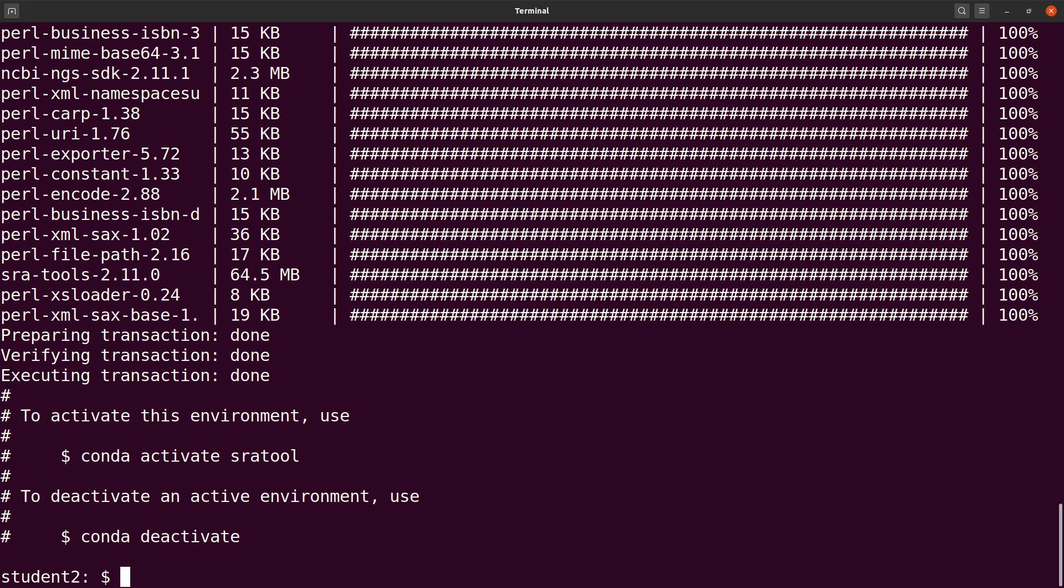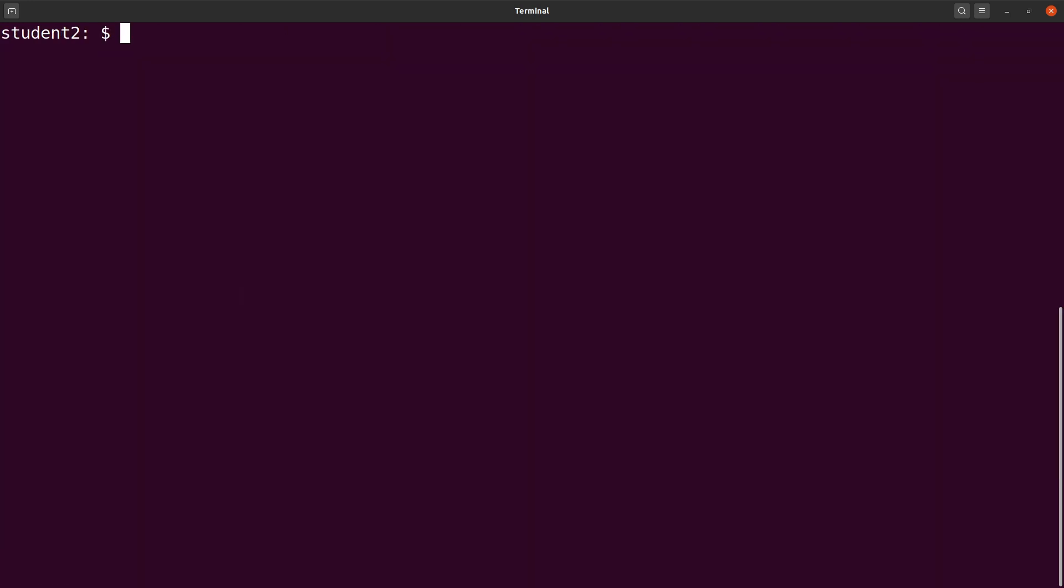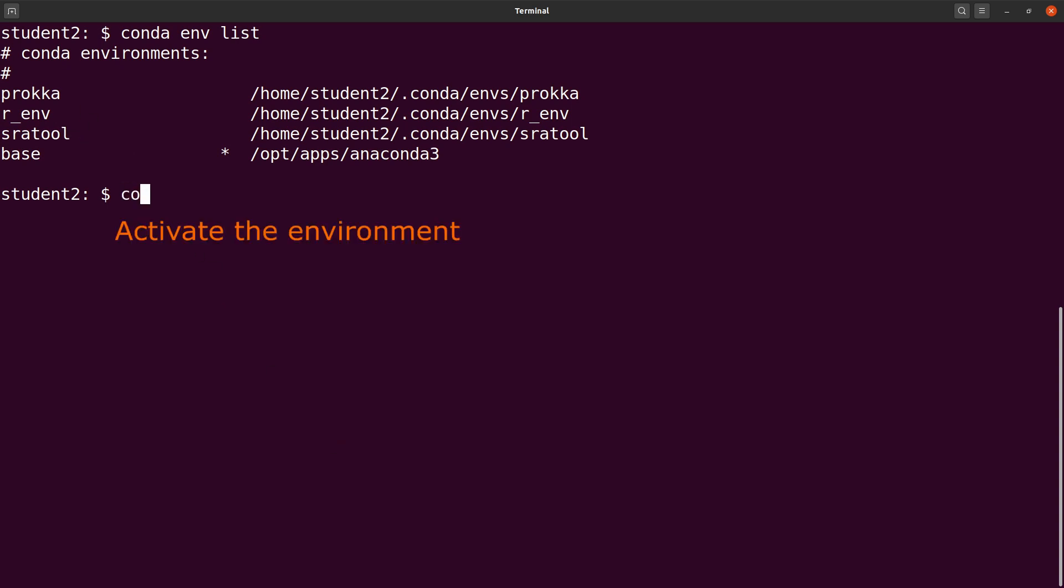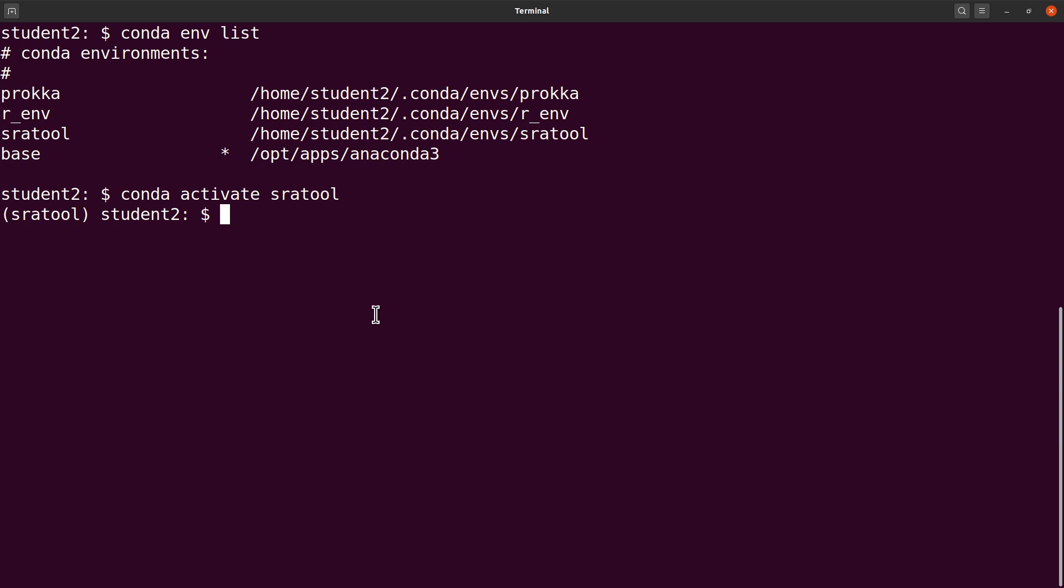With Anaconda, if you want to run a software, you need to first activate the environment in which you installed it. Let's list the environments in case we have forgotten which environment we created. We can say conda env list. This will show the list of the environments. There's the environment that we created and installed SRA tools in it. Let's activate that environment. We say conda activate sratool. We have it activated.